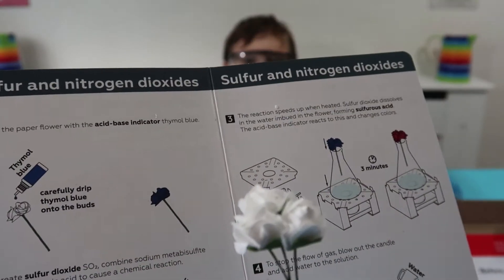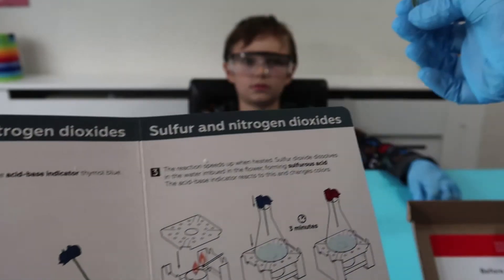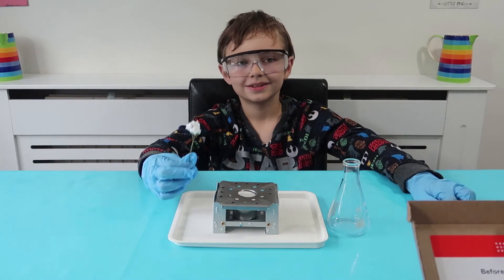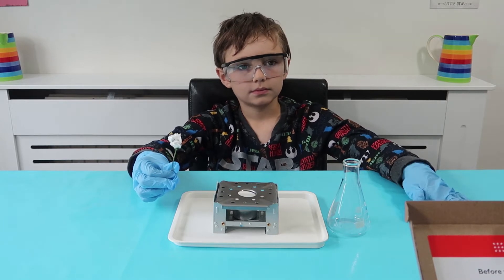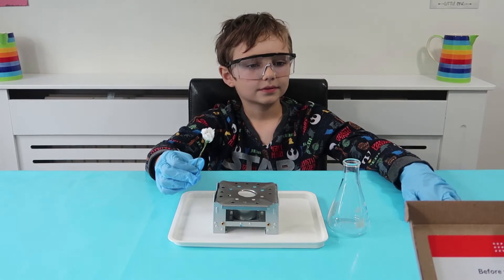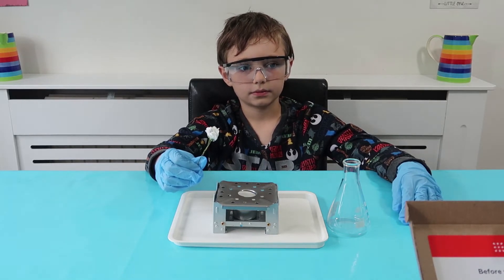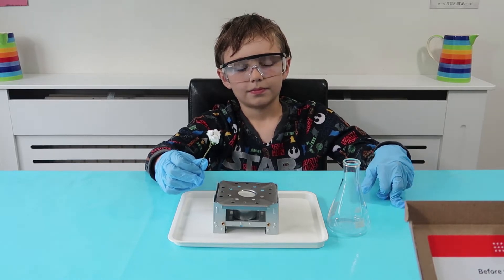So what do we need to do first? We've got these little paper flowers in the kit that are white at the moment. What I want you to do Oscar is take one of those white flowers — it's beautiful, it's lovely — and then we need to use some of this thymol blue solution. What you're going to do is drip this onto the buds of that flower to turn it blue.